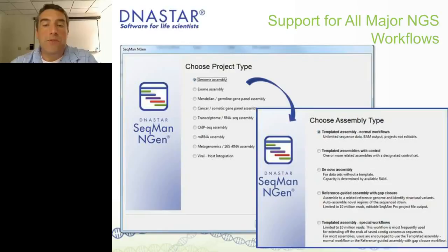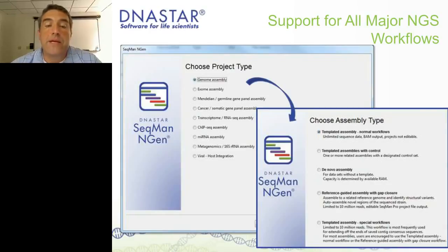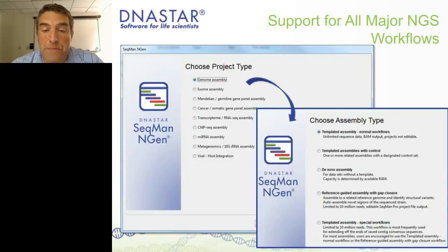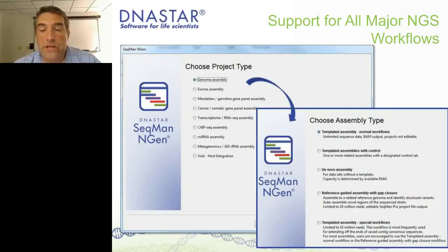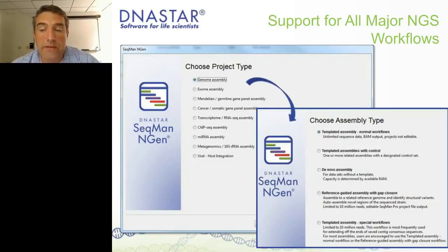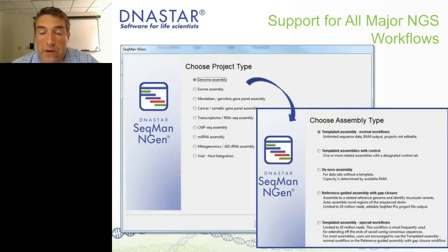Our software supports all the different NGS workflows. The starting point is SeqMan Engine, a 64-bit program that runs on Mac, PC, and Linux. You can choose different project types ranging from genome assembly to exome, to panels, transcriptome, ChIP-seq, viral, host integration, and metagenomic. This is really a project setup wizard. If you select genome assembly, the next page will let you choose the type — including a template assembly producing a BAM output file, or a de novo option using a de novo algorithm.